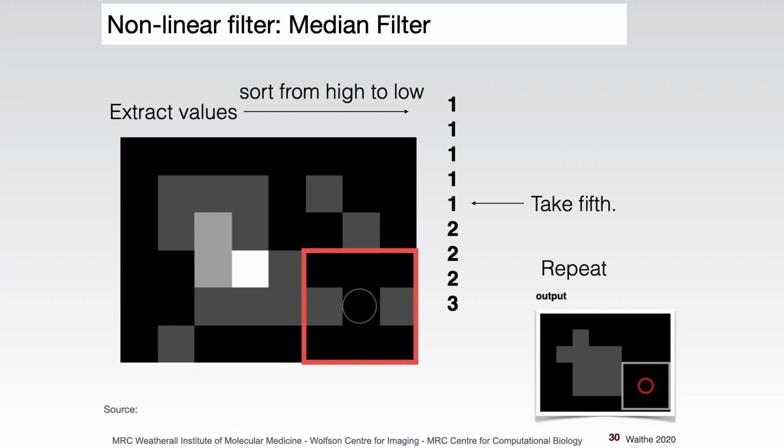Obviously you want to keep an eye open for it in case you start to see in your analysis something strange happening at the edges, or if you've done a filtering before the tiling, that it's not somehow creeping in. But yeah, generally you don't notice because it is just such a small part of your image. But it's good to raise your awareness of it. So that's an example of a nonlinear filter, the median filter.